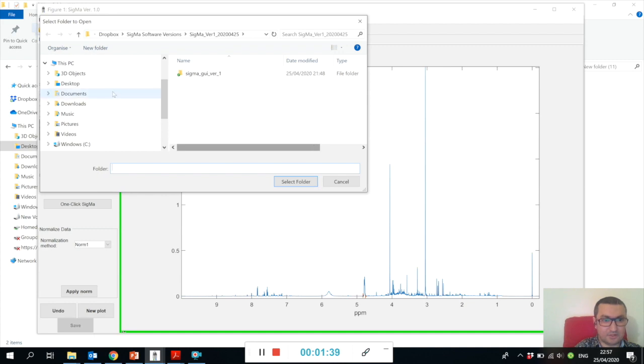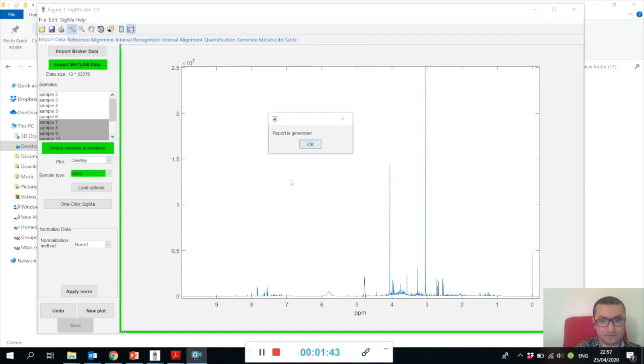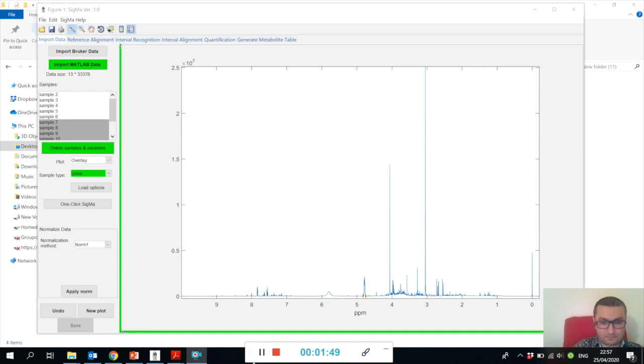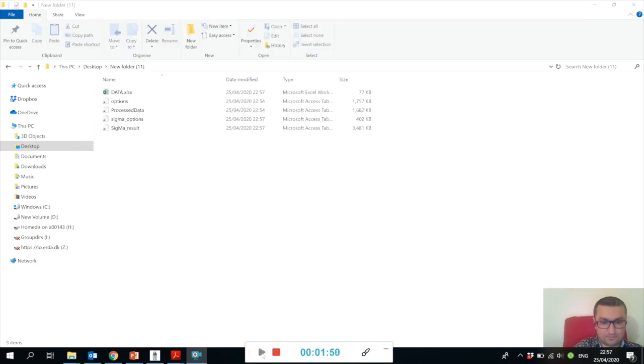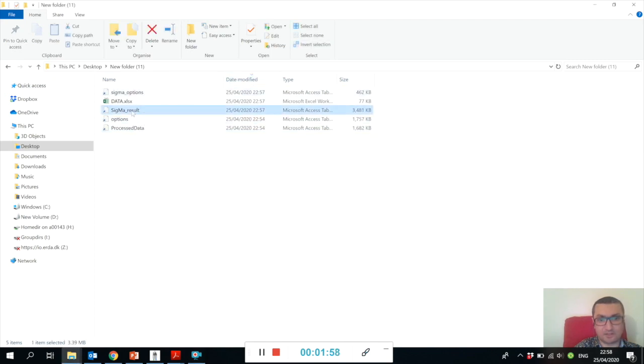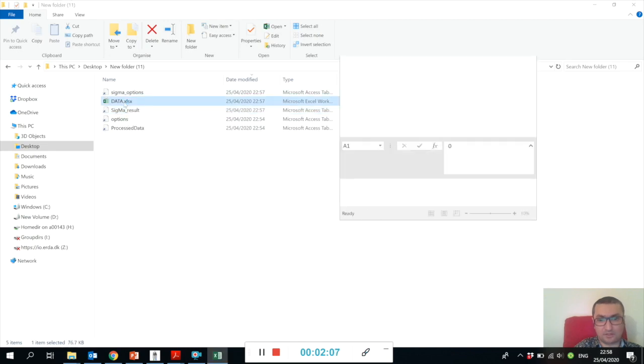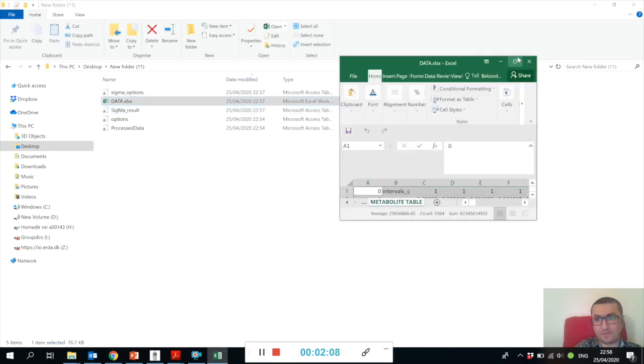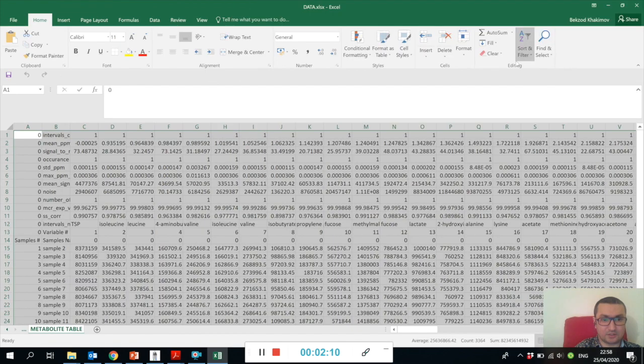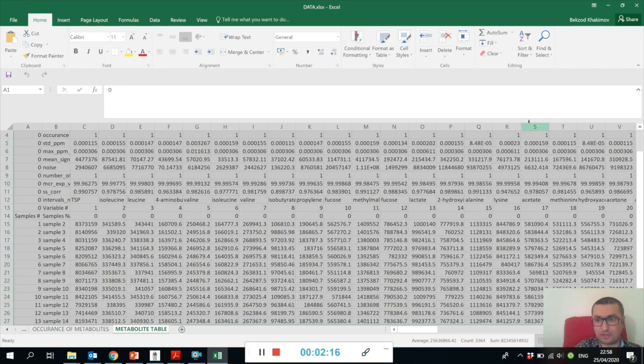Let me save it again in the same folder - New Folder 11. Now here you can see we have generated, if you sort like this, the Sigma result. This is a MATLAB data file.